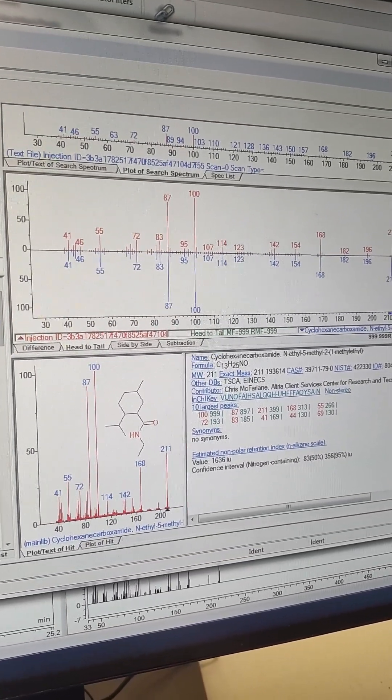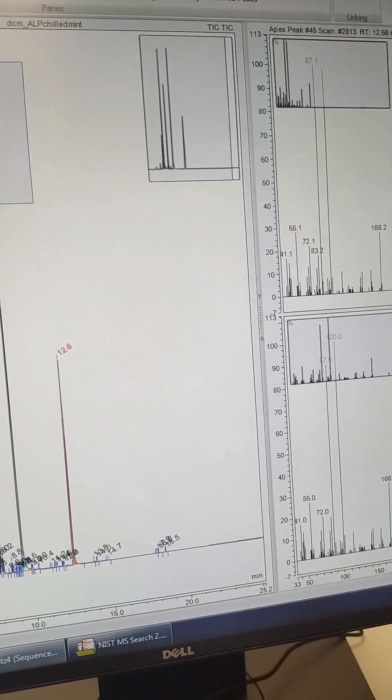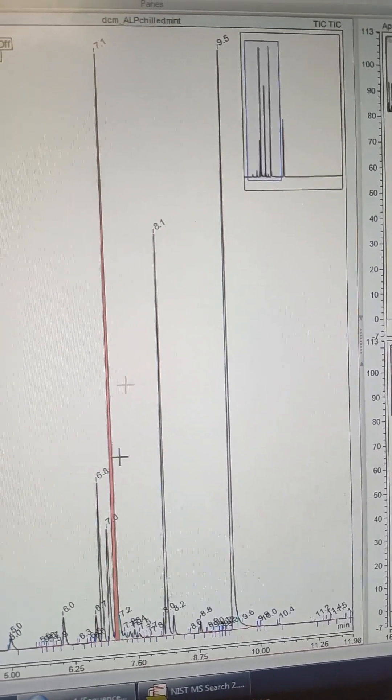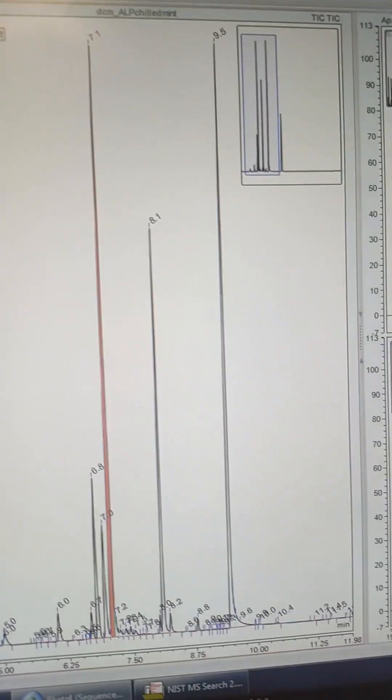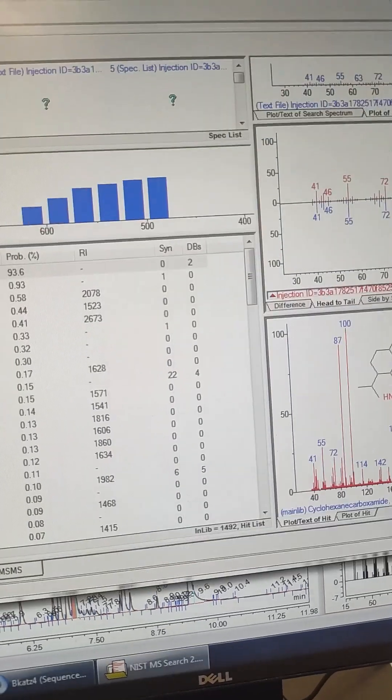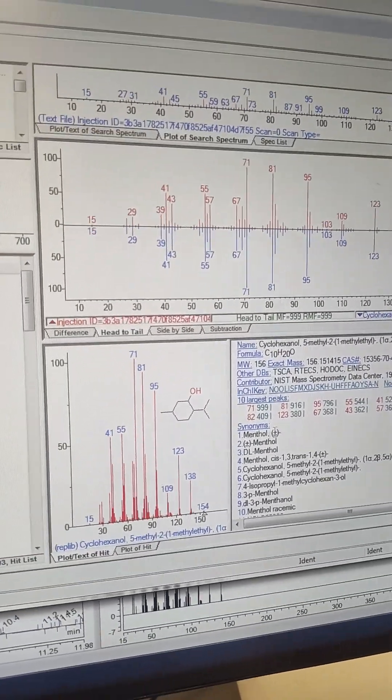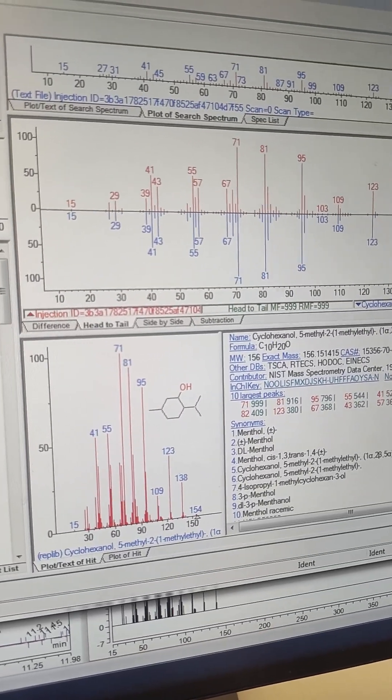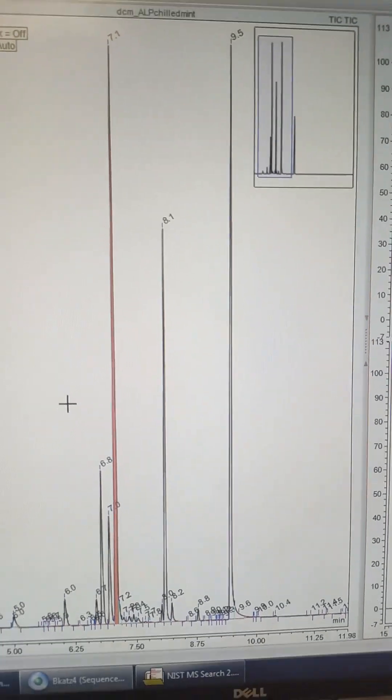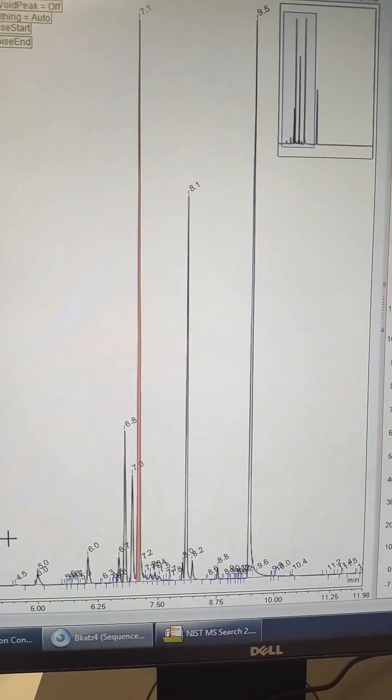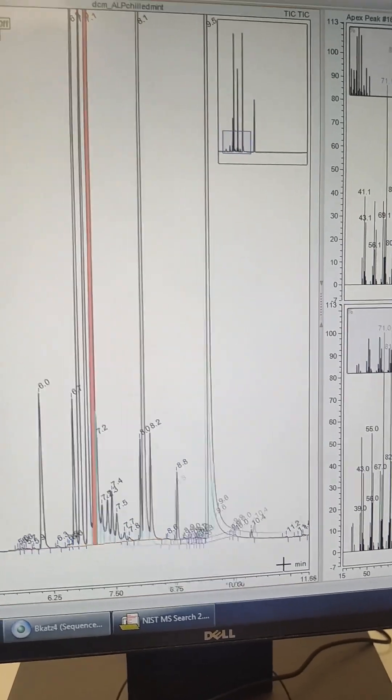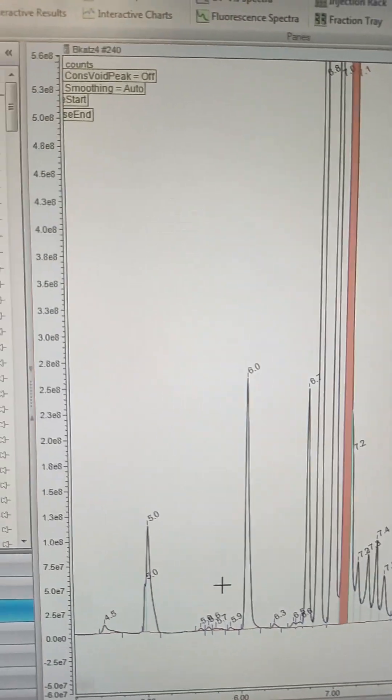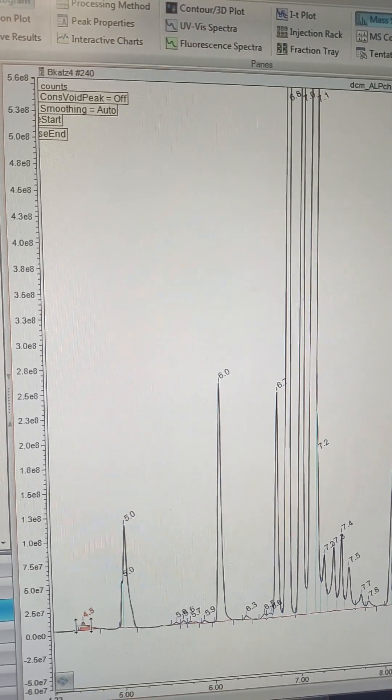All right, so now the rest of these things. All right, this is the most intense flavor other than the synthetic cooling agent and this is probably terpene one. Oh, that's just straight up regular menthol. You don't see a lot of straight up regular menthol these days but that's what we got, just menthol, regular menthol. And then look at all these flavors in this thing, it's just like a who's who of flavors here. Tons of flavors, let's go through them one by one for everybody.